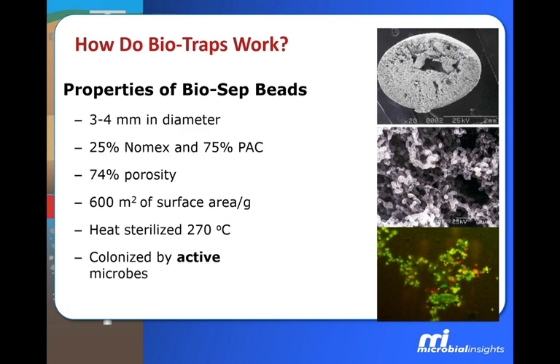As we all know, the ecology and the chemistry of a groundwater monitoring well can change over time. So a sample that we take today may not be the same as a sample we take 2 days from now, or 3 days from now, or 10 days from now. So by taking an integrated sample, we're dampening out those fluctuations that naturally occur in both the chemistry and the microbiology of those groundwater monitoring wells over time.